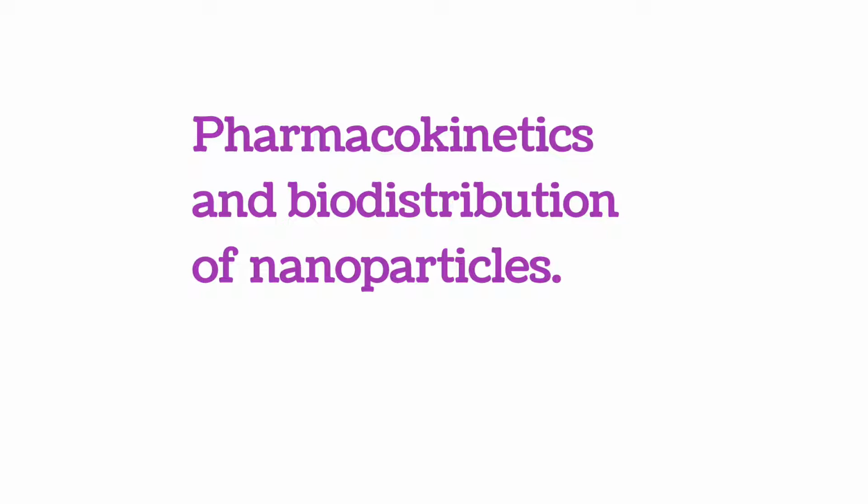You also need to have a control group where you inject the dye alone, so that it gives you an idea of the half-life of the dye, and whether the kinetics, toxicokinetics or biodistribution is because of the dye or because of your nanoparticles or drug.